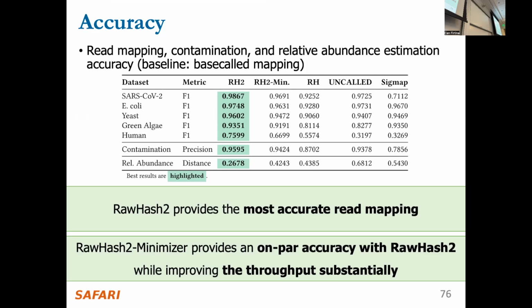Can you explain a little bit how you actually differentiate the signals? You mentioned that when there's a significant drop or a significant change in the signal, you categorize it as different from the previous signal. How do you make that decision? How do you know that that is the spot where you will change?